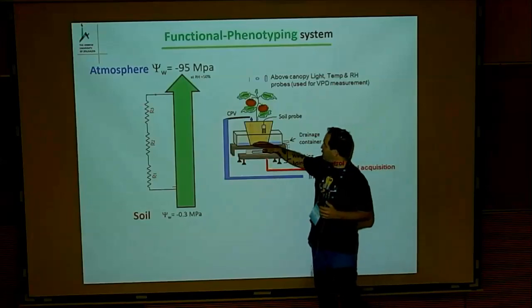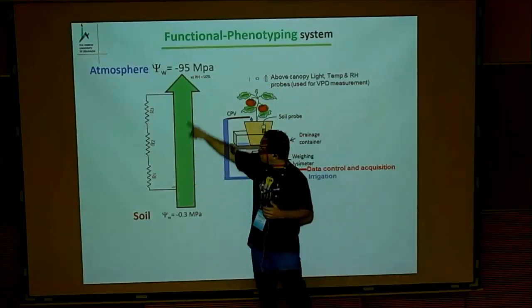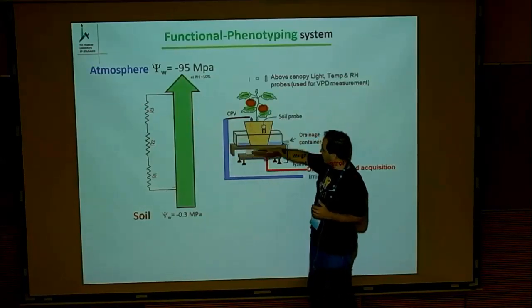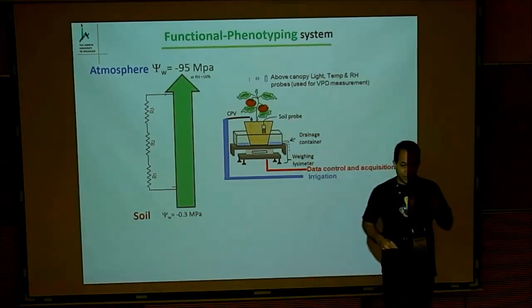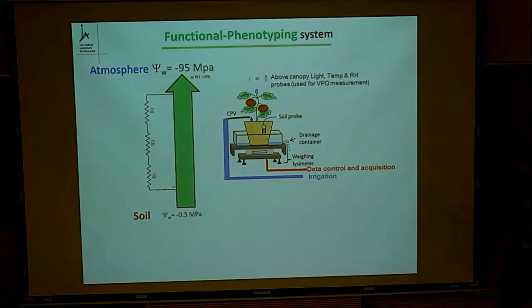So we know the soil-atmosphere gradient, and we treat each plant as a resistor, so we know how much water we lose, both from the whole plant based on the lysimeter and only from the soil based on the soil probes. We can put up to 3 probes per plant, so we can monitor the soil volume in a few spots. Usually we use the height.